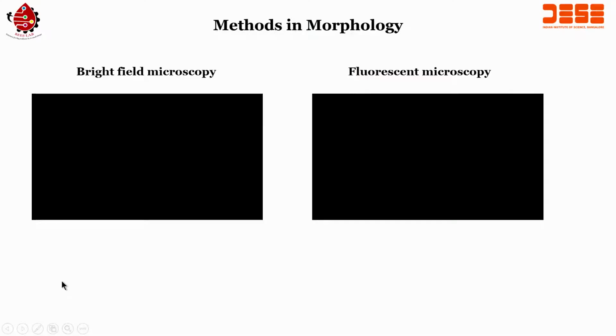These dyes show a particular color when you look under the fluorescent microscope. So, we will also see how the bright field microscope looks like, and then we will see how the fluorescent microscope looks like, right. So, let us see the video of bright field and fluorescent microscope. I will first play bright field.